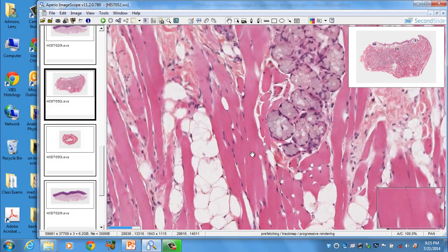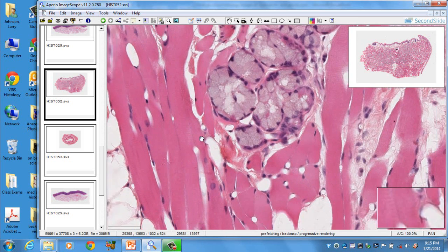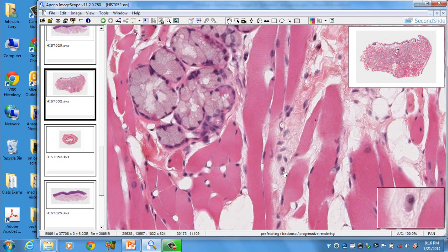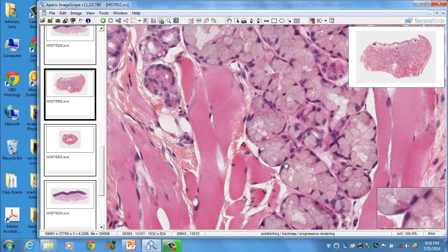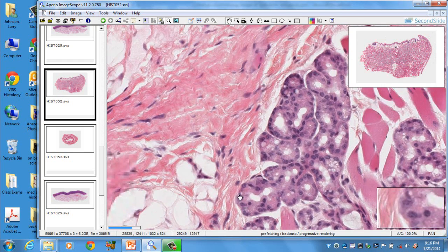These are skeletal muscle. You can see the striations in the muscle. You see the nuclei in the periphery and multi-nucleated cells there. These are capillaries in between there. So this is a small little capillary, another one here, here, and here. These are in the endomysium. There's a plasma cell right there that we could see. So mucus, remember mucus have a nuclei at the bottom. The serous have spherical nuclei, flat nuclei versus spherical nuclei that we see.